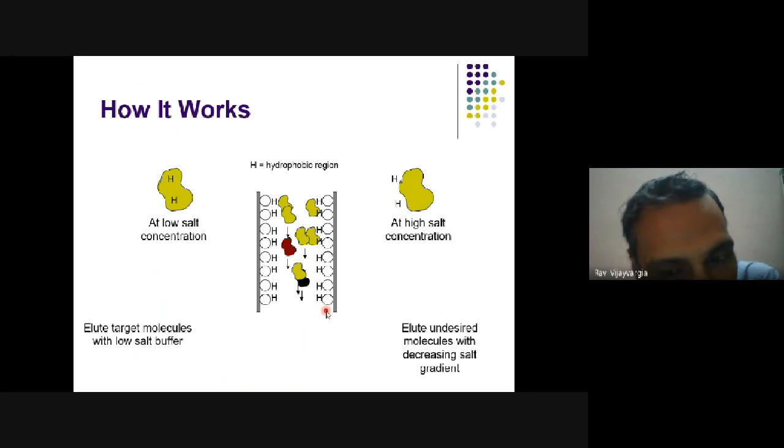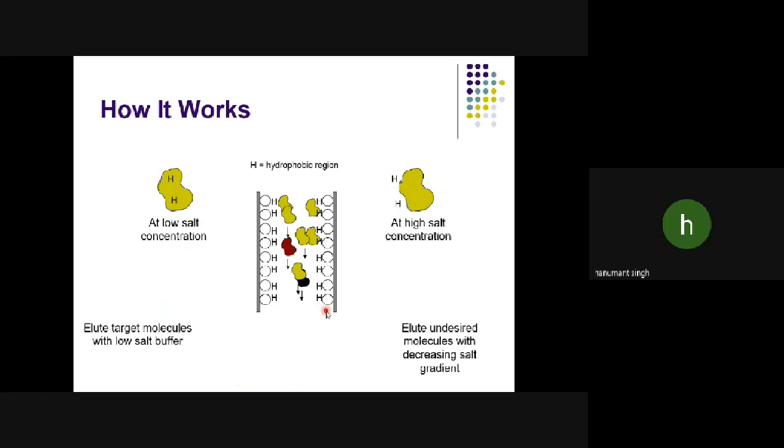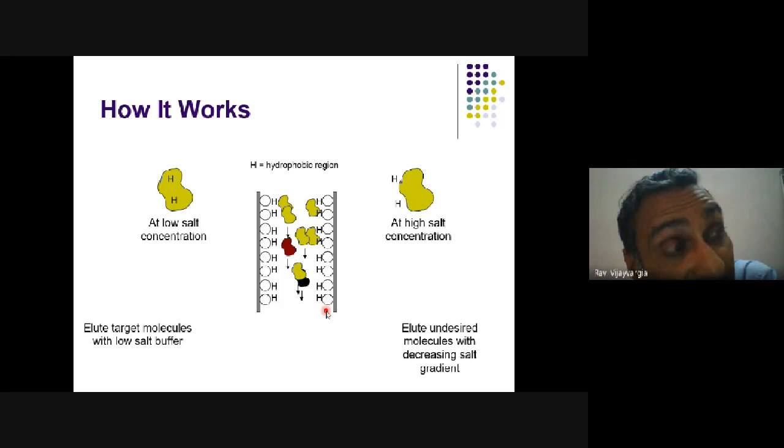In an HPLC column, if you have used one, you see that the nomenclature of HPLC columns is like that only: C4 column, C8 column, C18 column. Has anyone heard of this? It is not like glutaraldehyde or something. These are covalently linked hydrocarbon chains. A C4 chain means CH3, CH3, CH2, CH2, CH2, CH2. C8 column has 8 carbon, C18 column has an 18 carbon hydrocarbon chain.